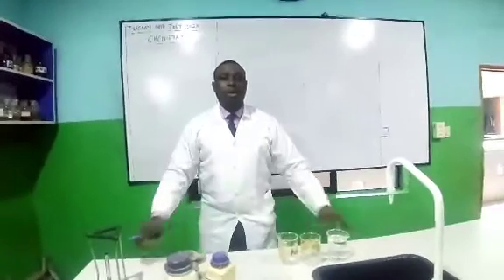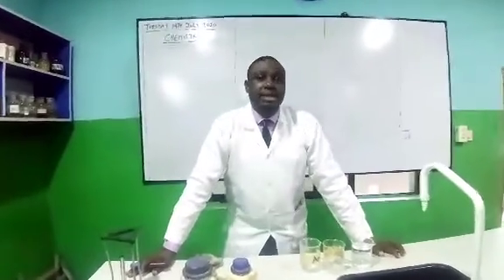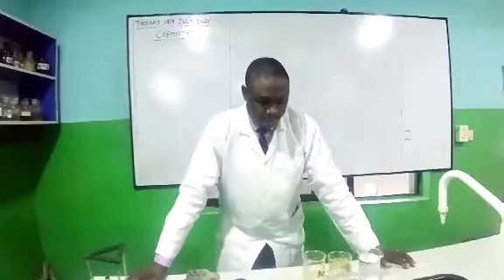Okay, in this segment, we want to look at the test for water.